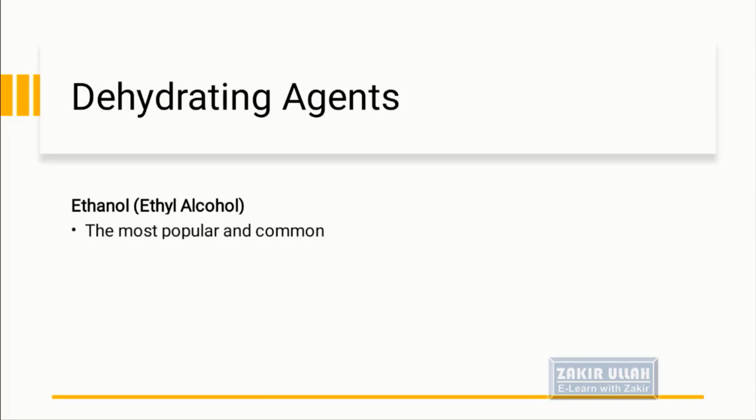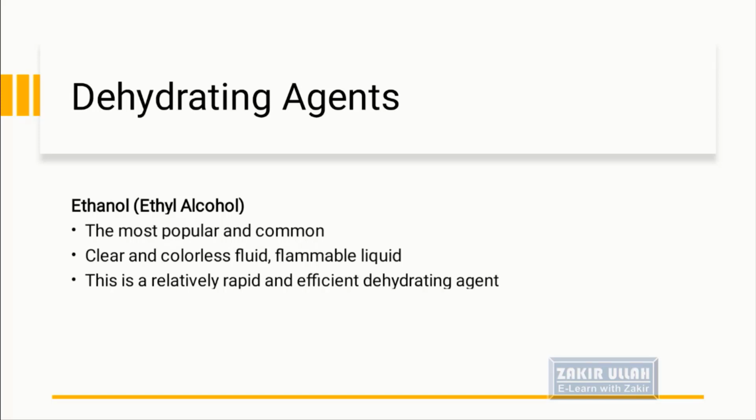This is the most popular and most commonly used. It is a clear, colorless, and very flammable fluid. The mode of action of ethanol is relatively fast, and it acts very efficiently.